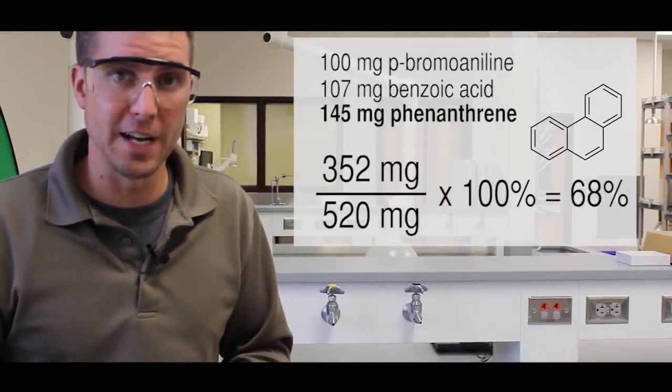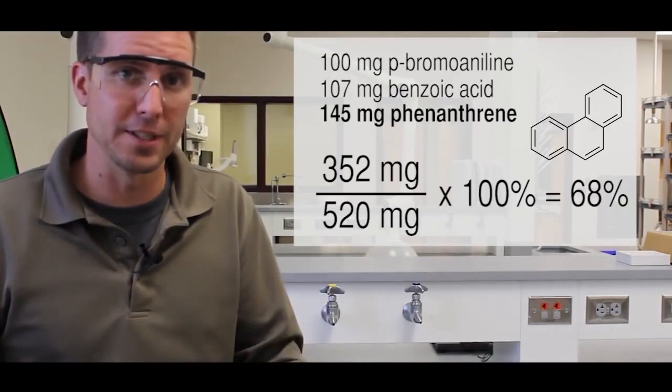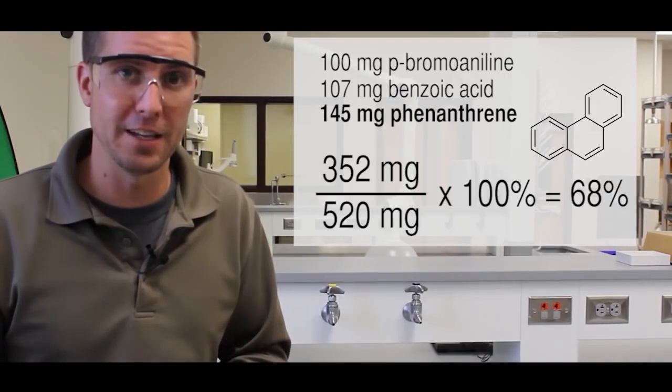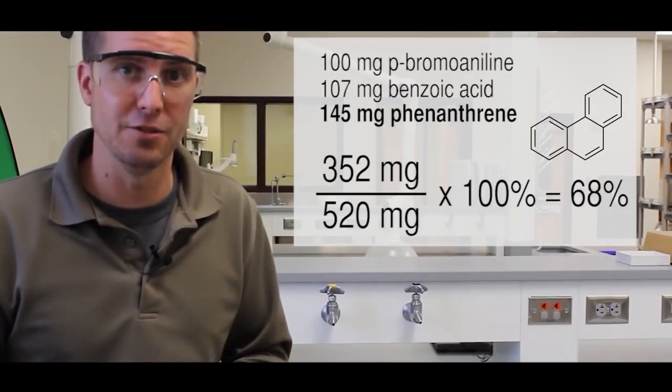The highest recovery for phenanthrene may be due to its greater tendency to always stay within the dichloromethane layer, and also it was recovered by evaporation of that layer as opposed to collecting it by filtration using the Buchner funnel.